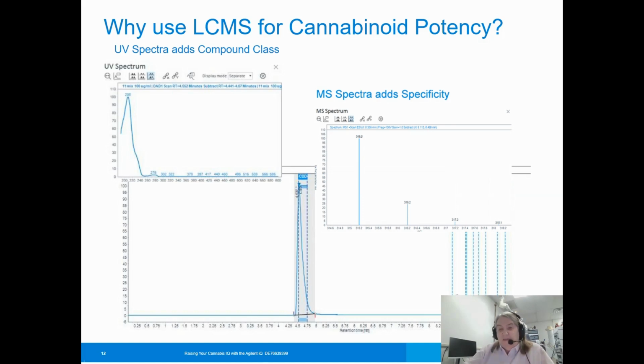So now we look at the LCMS spectra, and we actually have, notice, all the way down to the 4th isotope. So we now have firm identification of the compound that we're looking for. This is the power of LCMS.